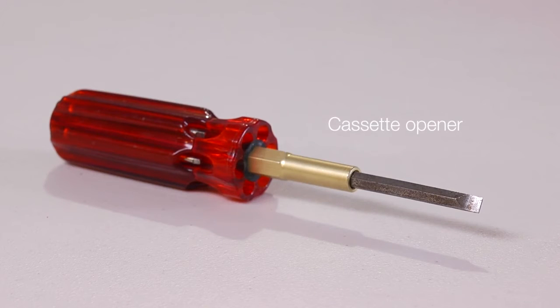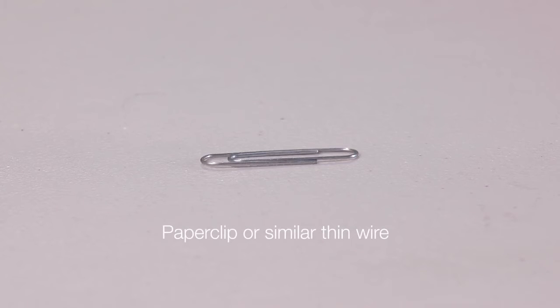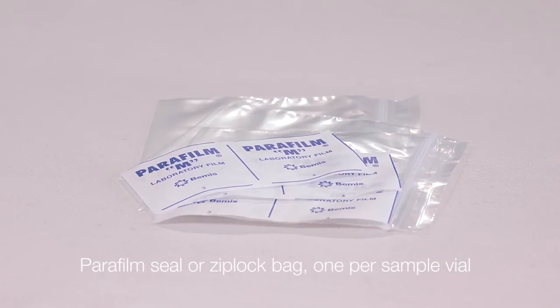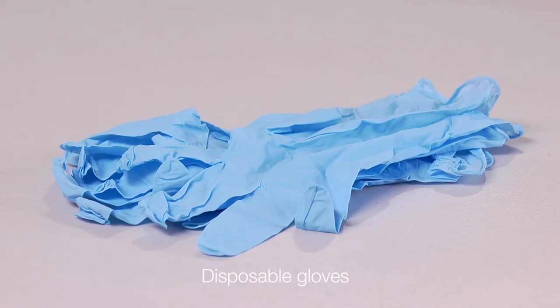Cassette opener, a screwdriver, coin or other flat tool, paper clip or similar thin wire, tweezers or forceps, parafilm seal or ziploc bag one per sample vial, and disposable gloves.